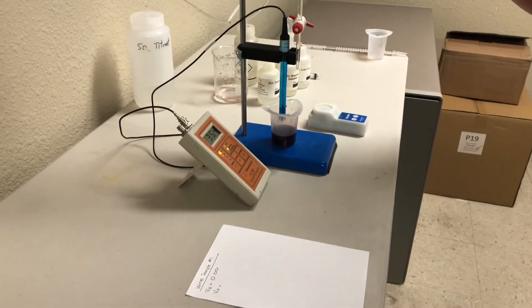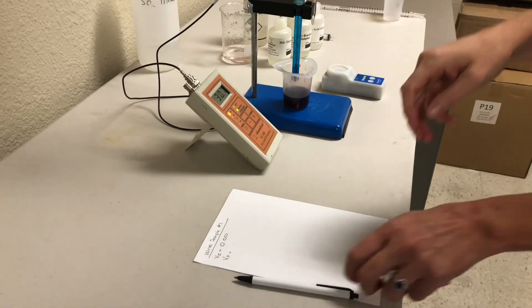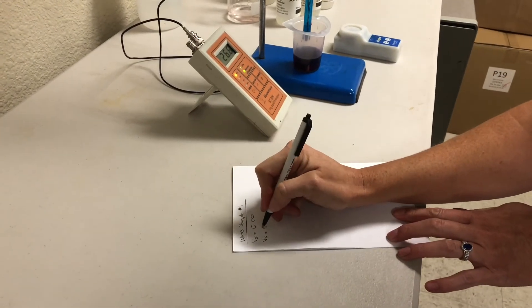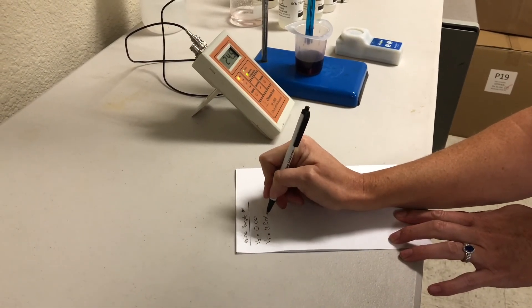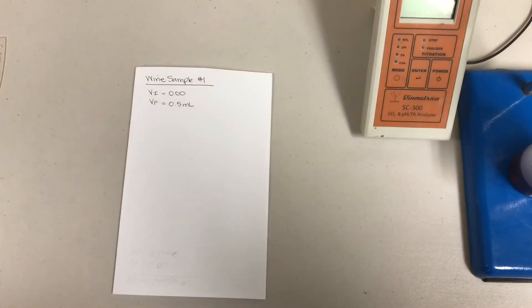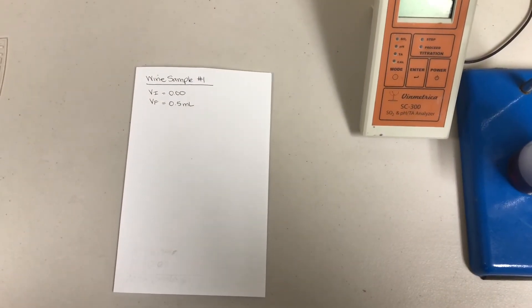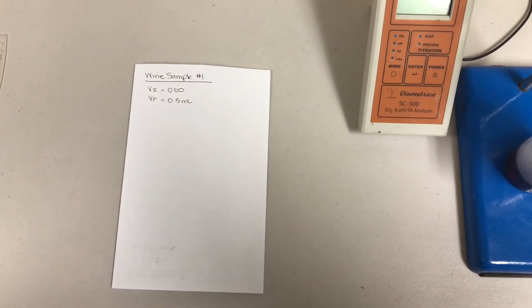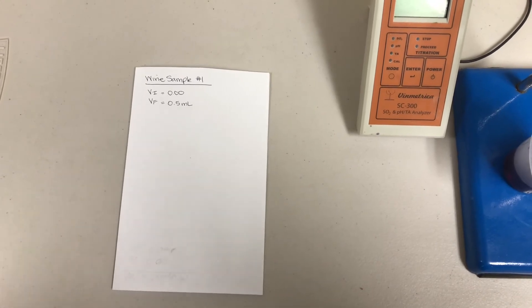So the burette is now reading 0.5 mils. To calculate the parts per million of SO2 in your wine sample, you'll use a simple algebraic equation.